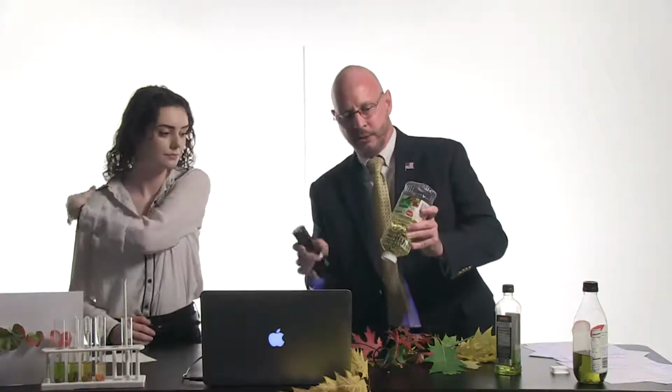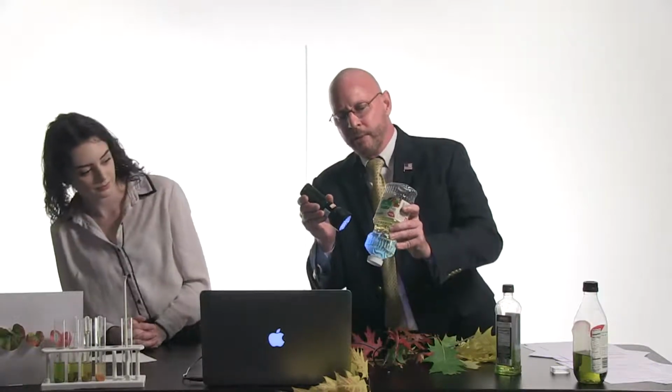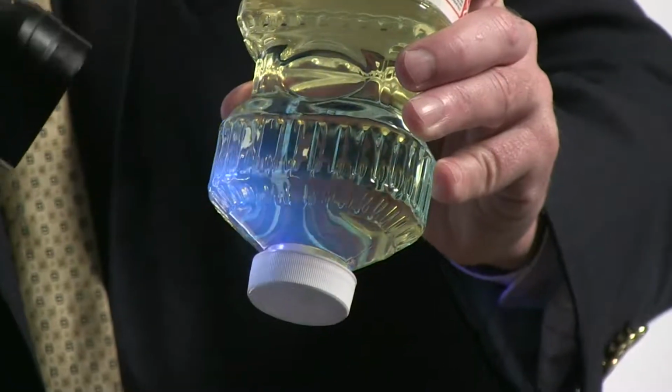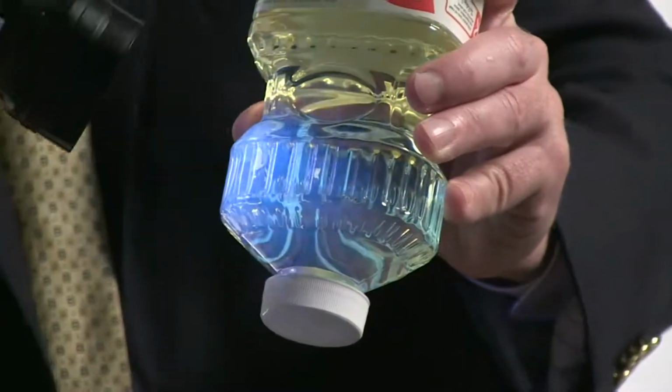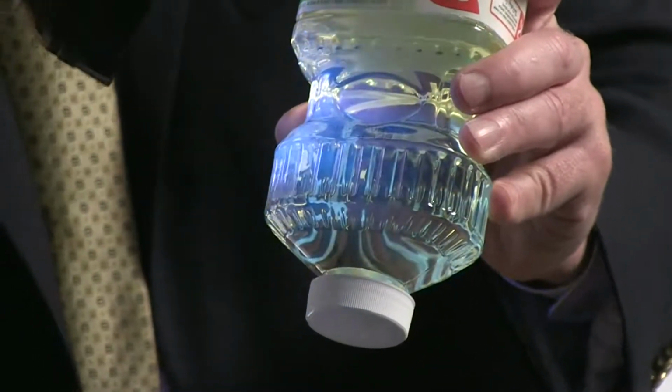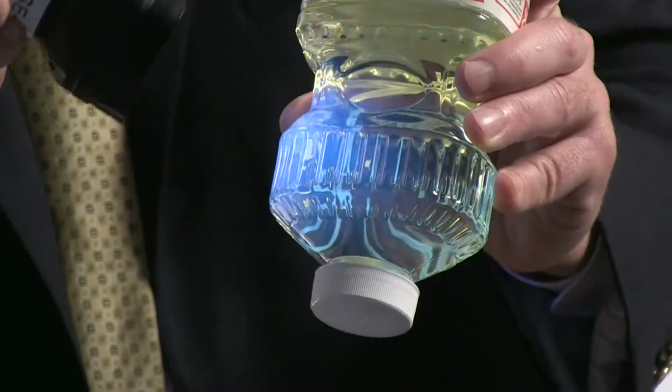So I'm going to show you, and let's see if we can't focus in on this. I think we need to shut this light off. If someone can give us a hand and turn that light off, I'm going to shine this here. And this is just vegetable oil, soybean oil, and I'm going to shine my light over that. And do you see any color changes at all, Mackenzie? Not quite. Just looks like the light's reflecting a little bit. It does. Just looks like the light's reflecting, and I don't see anything going on there.